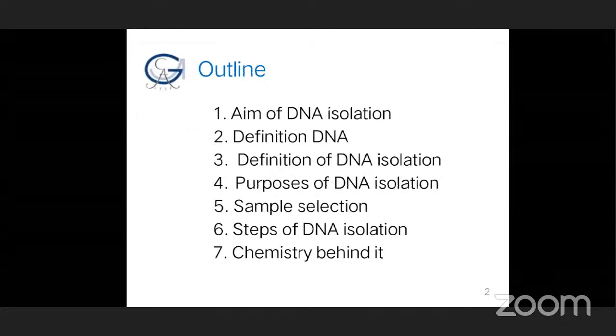Okay. Then see the outline of this topic. First, aim of the DNA isolation. Why DNA isolation is important? Aim means to isolate the DNA from given blood or tissue. Second, what is the definition of the DNA? It is the segment of chromosome. This is the definition of the DNA. And this part is completed in your previous year standards, 10th, 11th, 12th, etc.